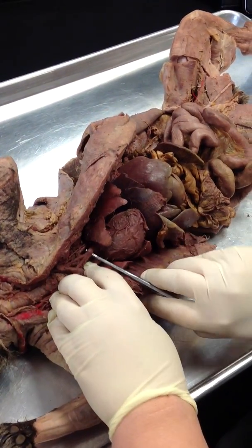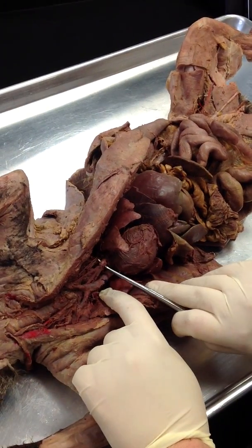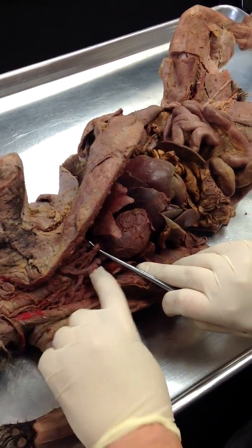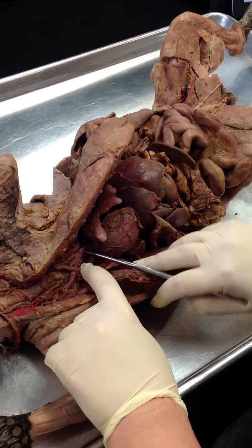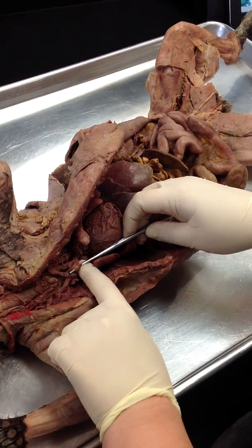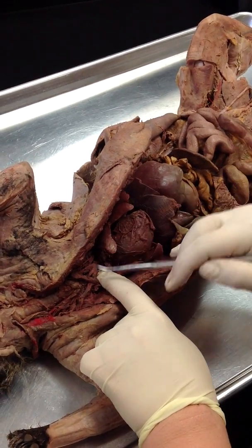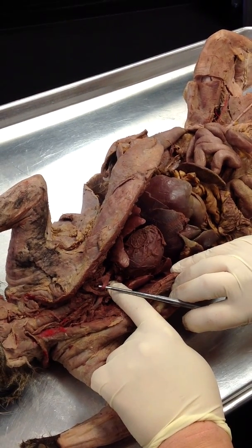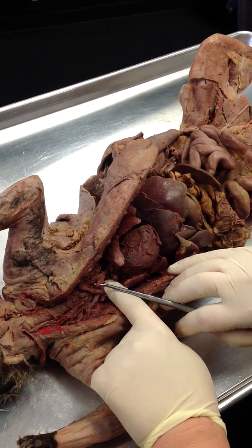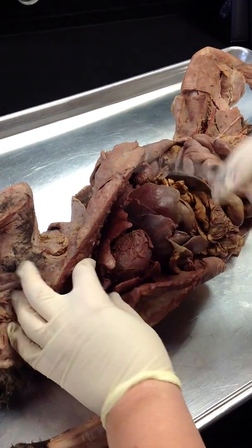Do you know what this is? Is that the brachiocephalic? So that's the brachiocephalic artery, and it splits off into three things, right? 1, 2, 3. Okay. So what's this thing that's farthest to the side? Subclavian. Which subclavian? Right subclavian artery. Remember whole names. And then this one is the right carotid artery. Right common carotid artery. And then that is the left common carotid artery.